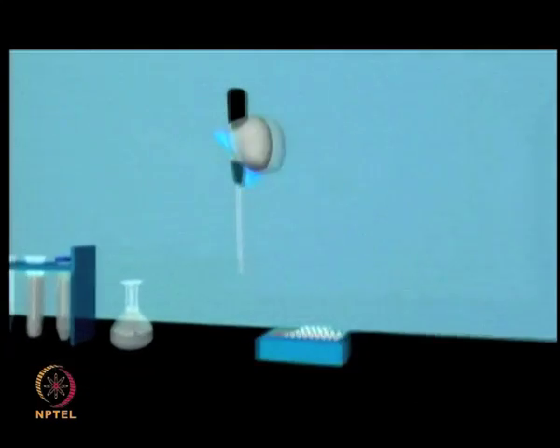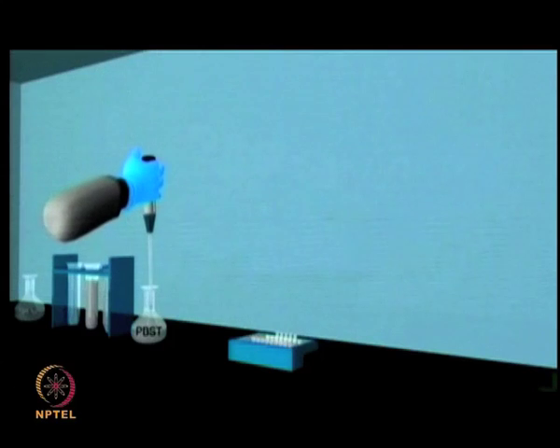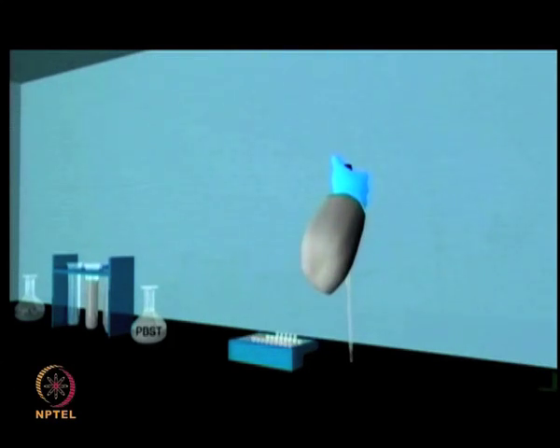Once this step is done, you need to wash the slide with PBS tween 3 times. Usually a 5 minute wash, 3 times at room temperature with gentle shaking on a rocker shaker, is most commonly used.